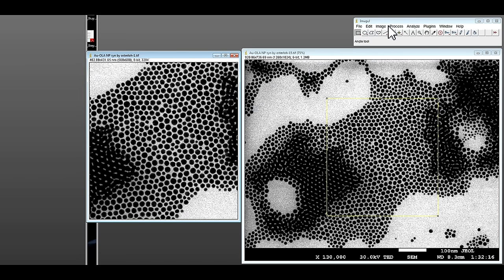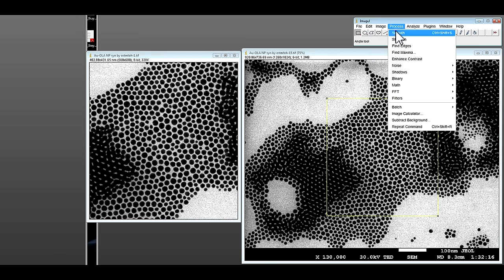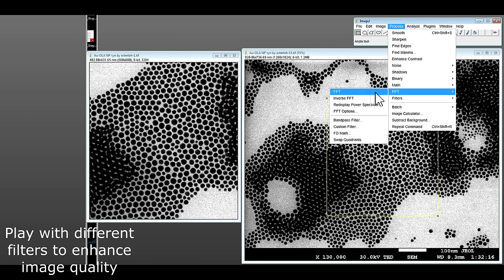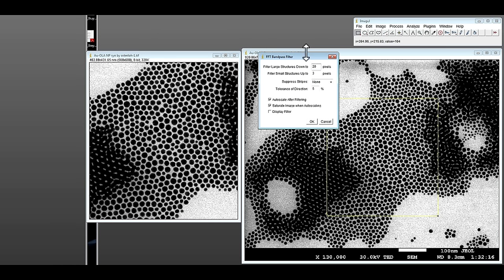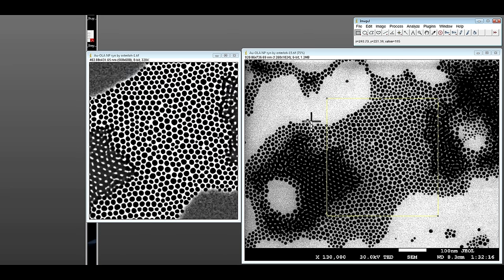Now let's apply band-pass filter. It will flatten the image to some extent and reveal some details, and you will be noticing some change.